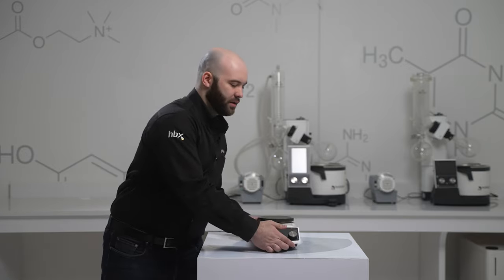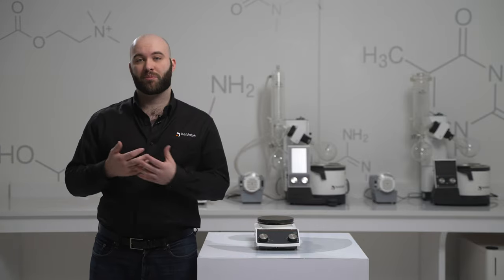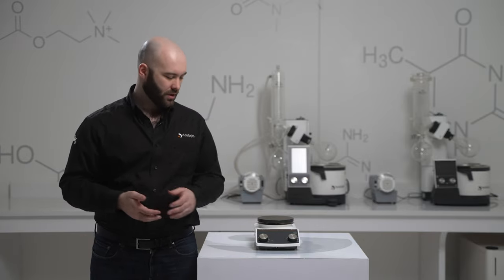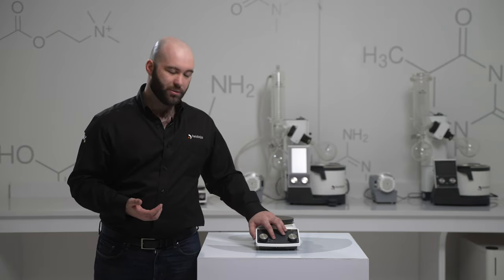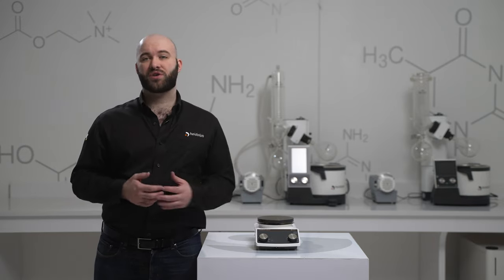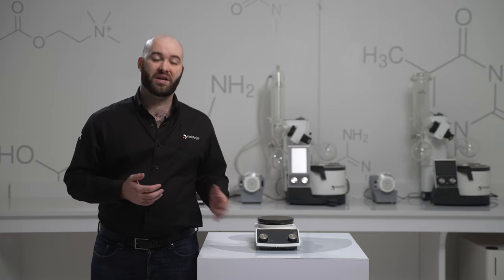The EKT HiCon allows monitoring of the process temperature. On top of that, some returning safety features include the illuminated heat indicator so that you can see from afar whether or not your hotplate is heating.